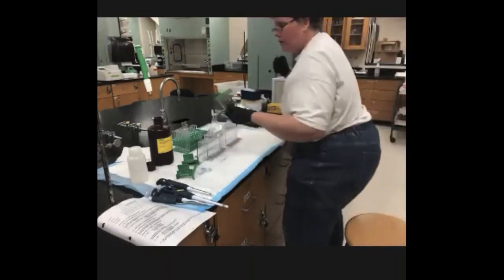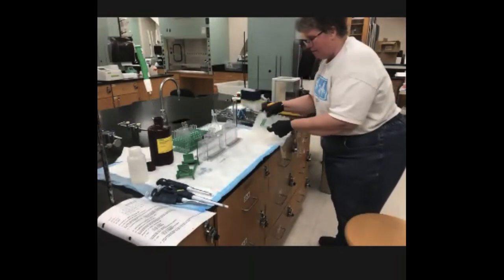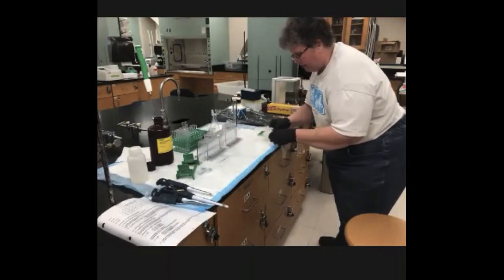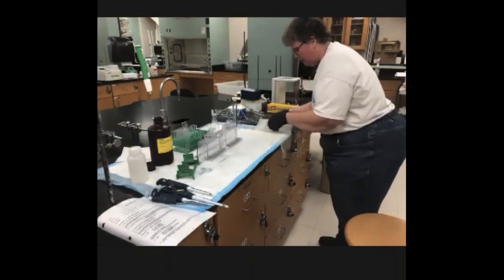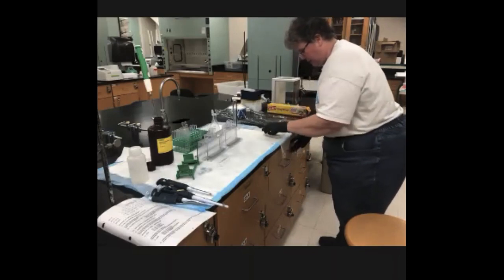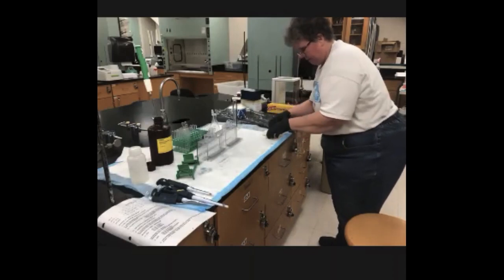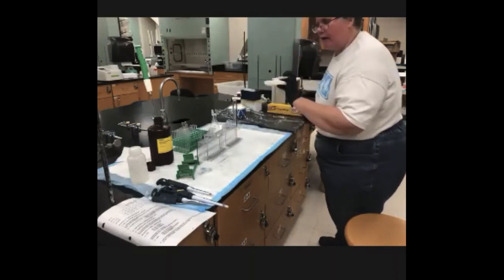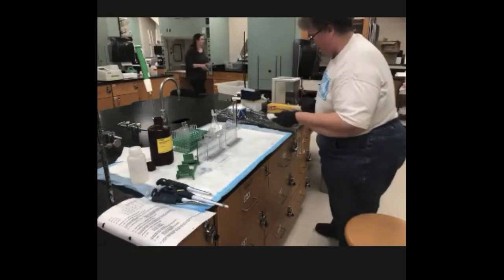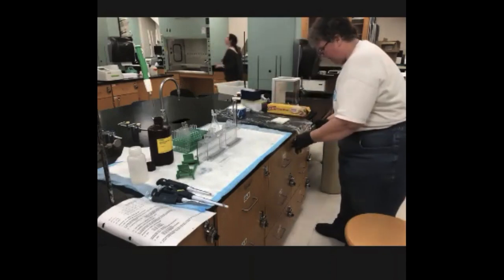To be able to store your gel until the next lab period, you're going to add wet paper towel, and you're going to wrap it in several layers of wet paper towel. You don't want it to dry out before next class. Then after you have it wrapped in multiple layers, this is four paper towels that are soaking wet, you're going to put it in some Saran wrap. You're going to wrap it in Saran wrap.